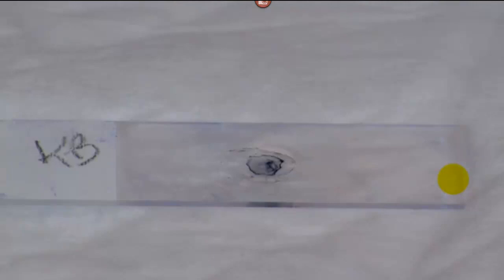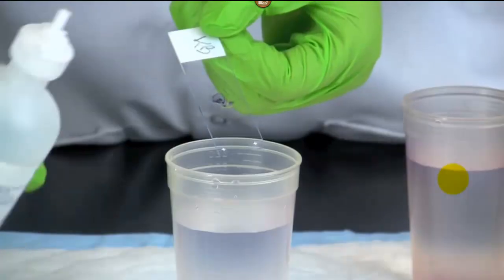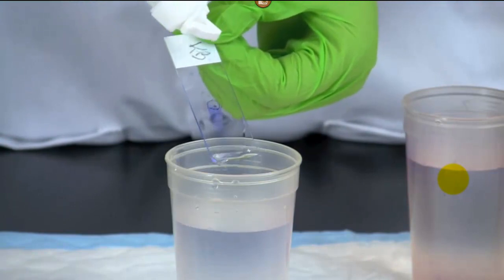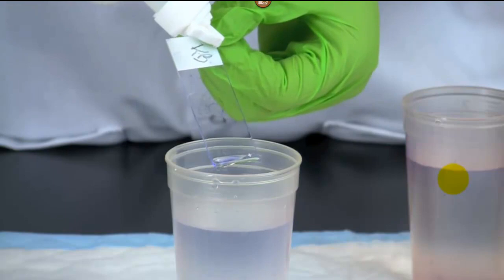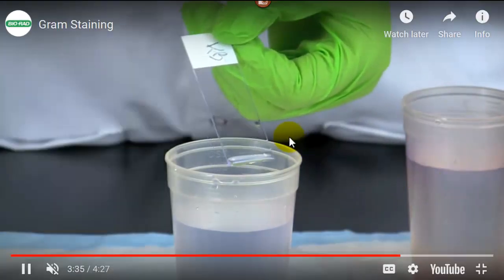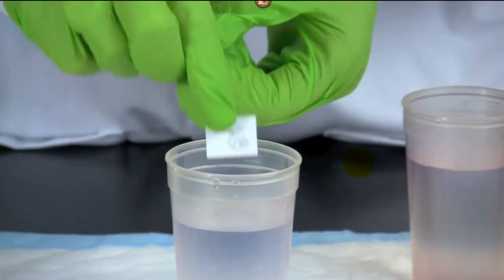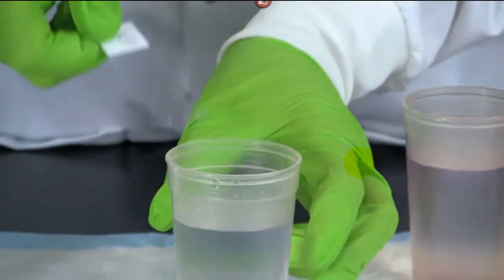Now, next you do acetone alcohol, and you only do a few drops. It's called a decolorizer. And this is the critical part. If you have a gram positive, it's not going to be decolorized. If you have a gram negative, it will be decolorized. And they did a lot of drops. We don't usually do that many drops, but you can see it got decolorized. So I'm guessing here this might be a gram negative. You never know, because it looks like it all came off as far as the crystal violet part.